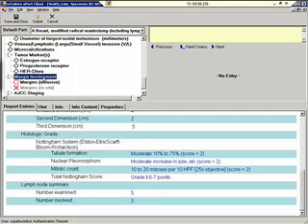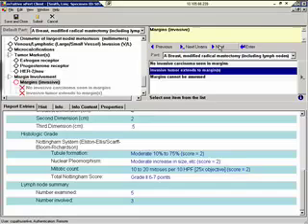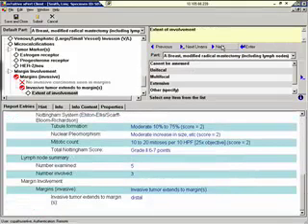Let's navigate down to margins. We'll select Invasive Tumor Extends to Margins. Here we'll enter distal. And we'll indicate the extent of involvement is unifocal.